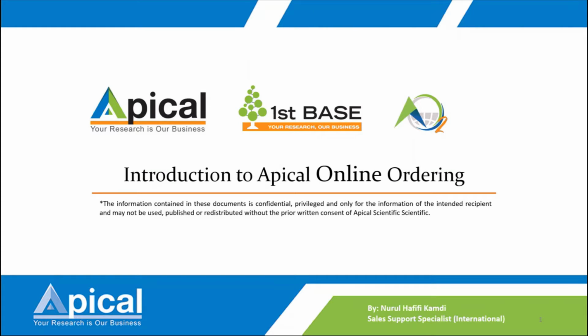Sometimes you just need to verify the sequence of your PCR, for example to check your qPCR product sequence, then you just send it for sequencing. You won't use next generation sequencing. So there are pros and cons, and you need to know what your objective is.